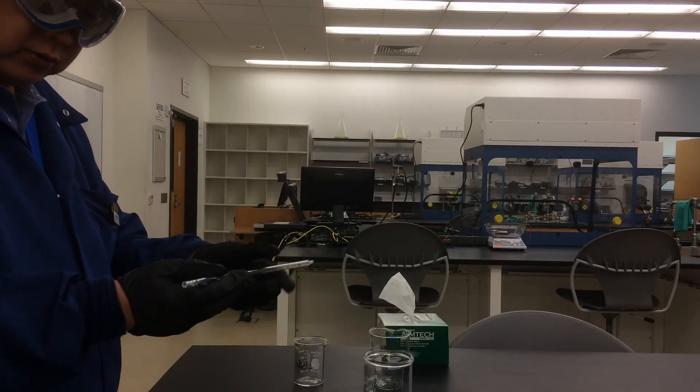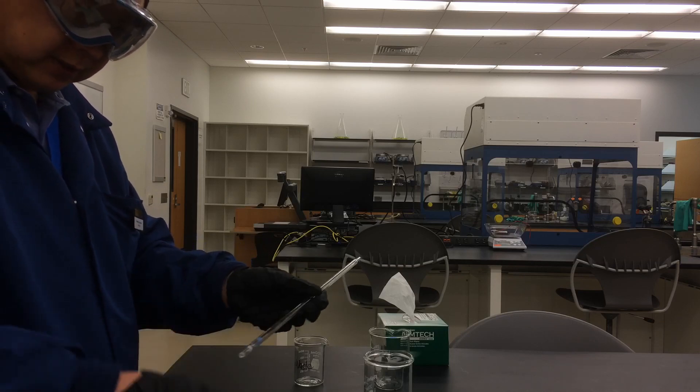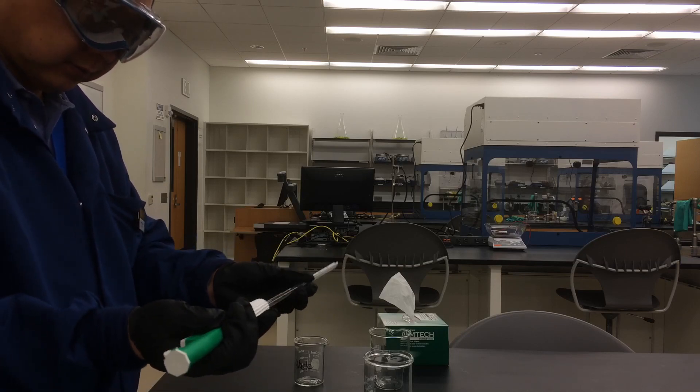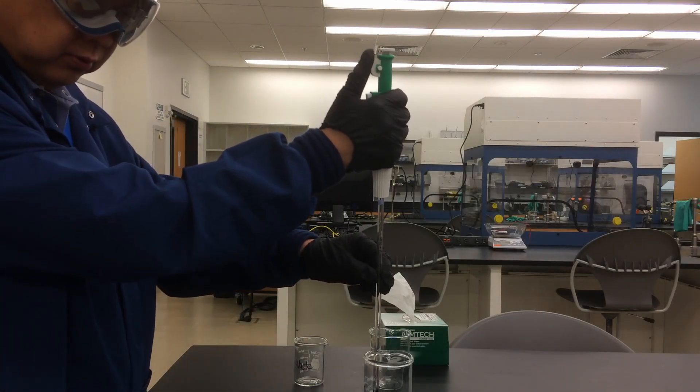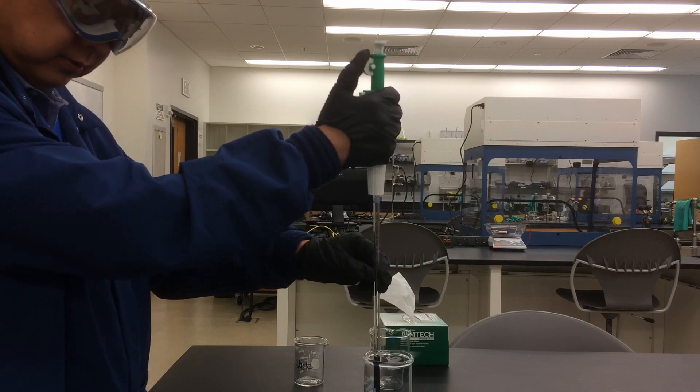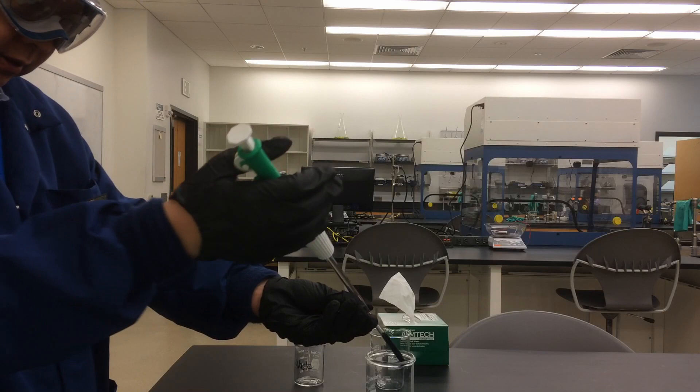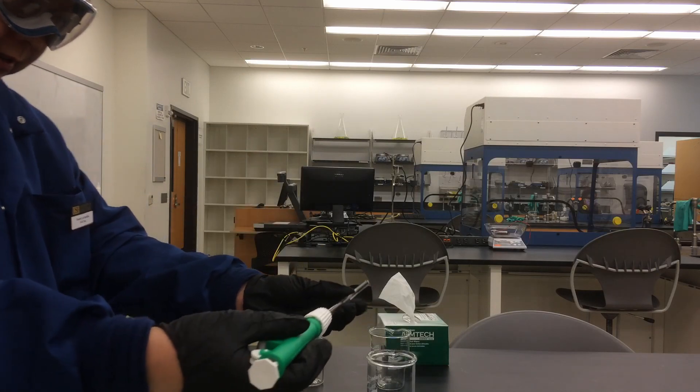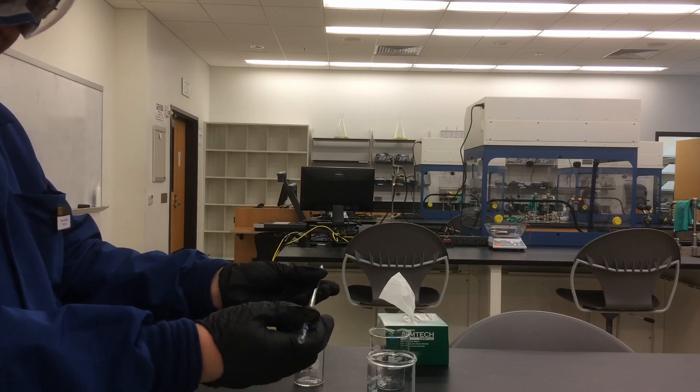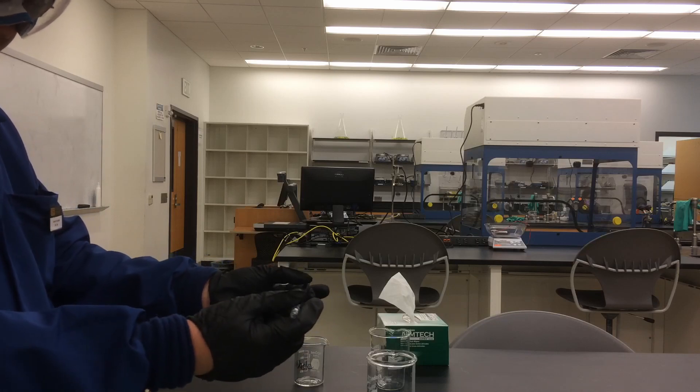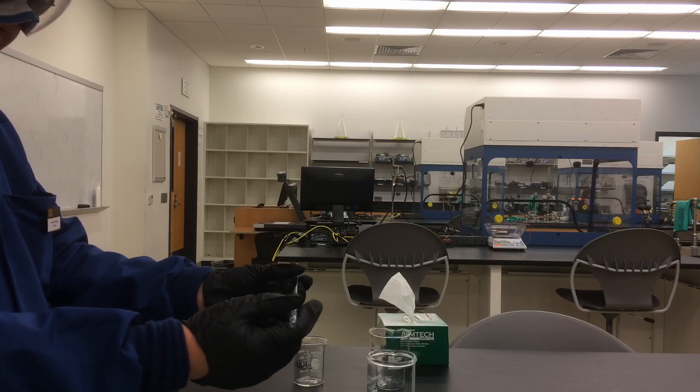Now, I'll show you how to use the graduated pipette. First, condition the pipette. Move the wheel to withdraw some solution, and turn the pipette on its side and rotate it, changing the angle to rinse the inside wall of the pipette.